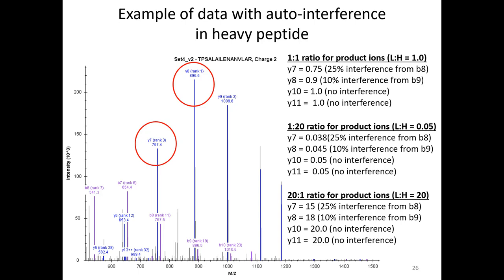And often this can be sort of killing 2 birds with 1 stone, where if you're not sure how much of your standard to spike, that can be the one thing that is varied between these ratios. You can see, oh, should I spike 5 femtomole or 50 femtomole or 500 attomole, and then adjust the light accordingly. So you can gauge what the best spike level is for your samples, and then assess for interference too. It's not wasted, particularly if you find that there are no interferences. It may be a bummer because you're like, oh, well, all that for nothing, but it's good because you've established you have no interferences.